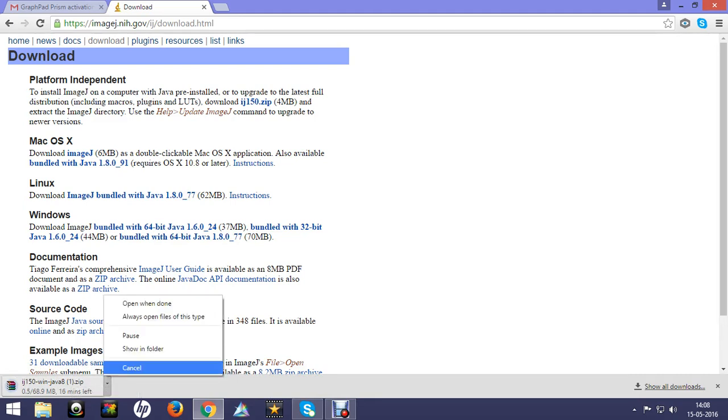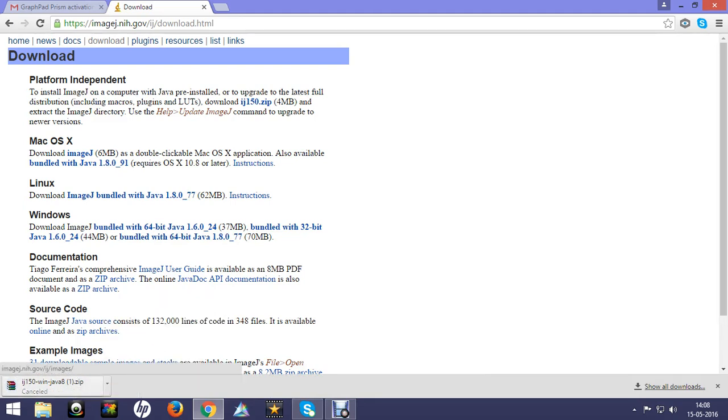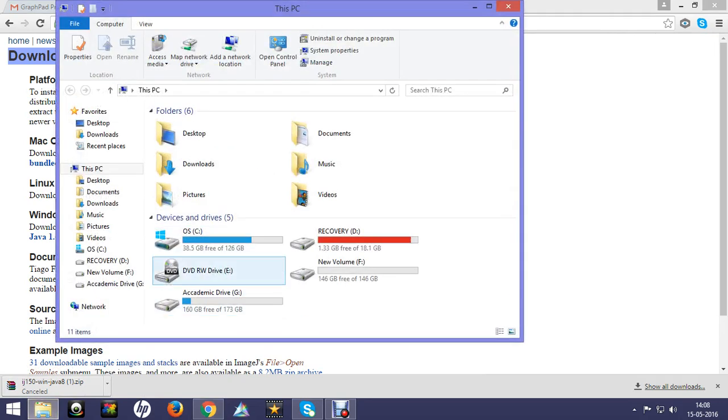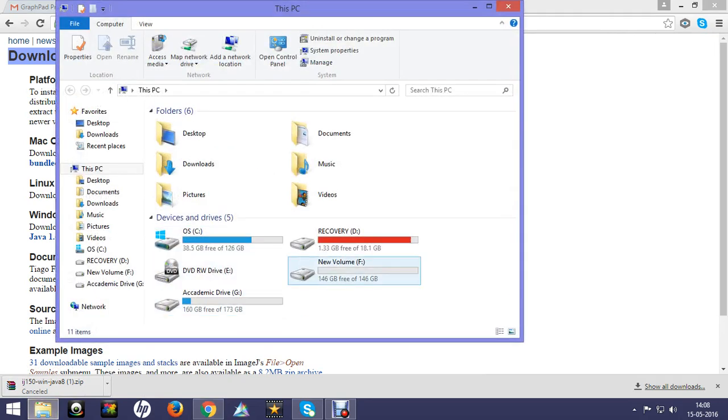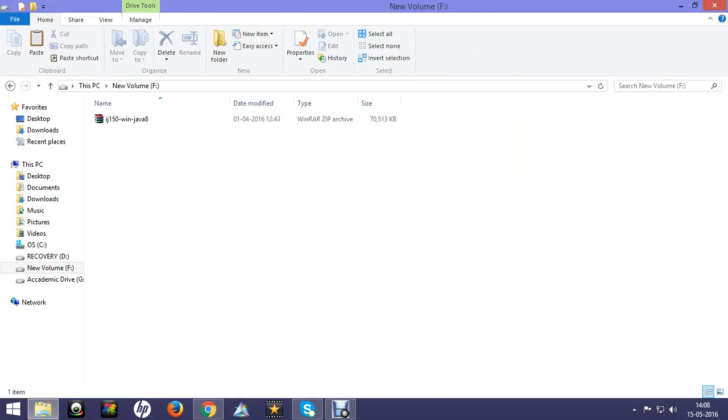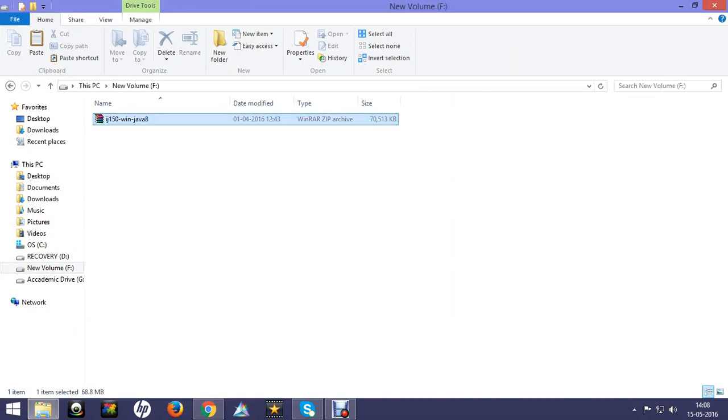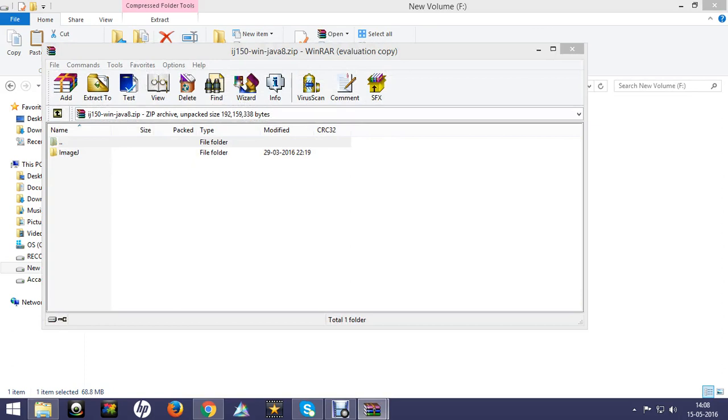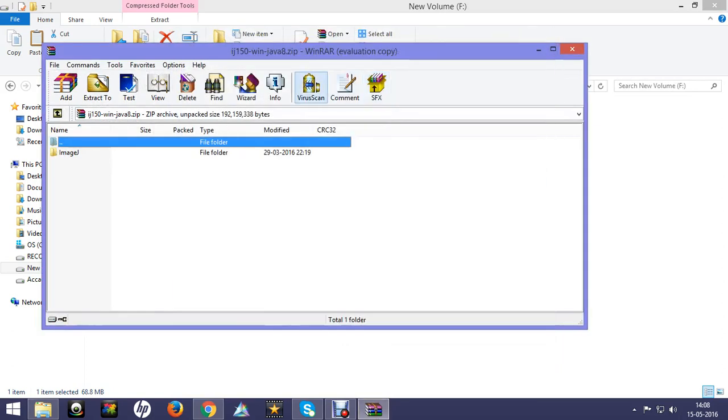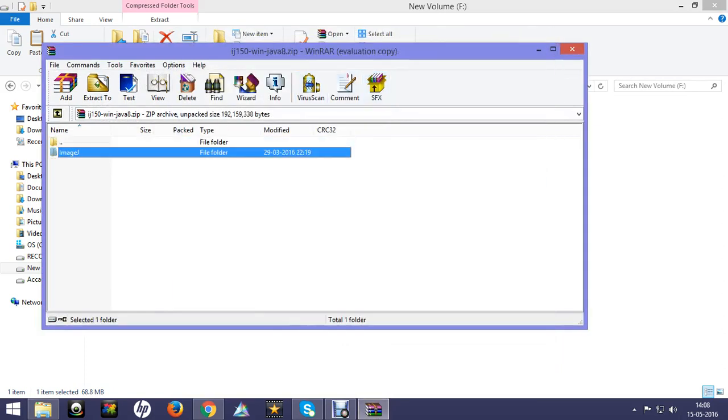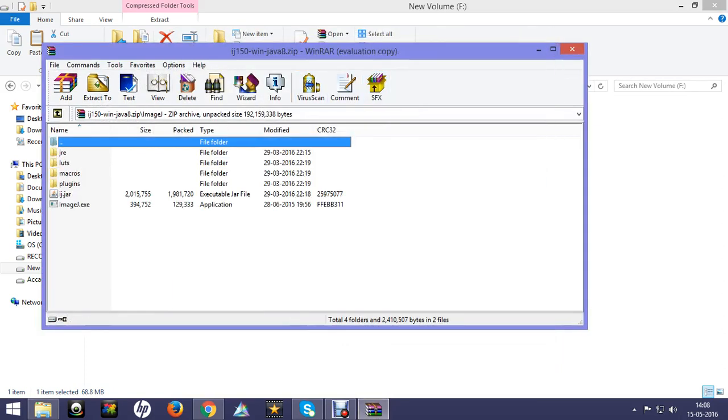As I have downloaded it previously, I will show you directly from there. When we click on that application, there is a folder for ImageJ and there is an ImageJ.exe file, a setup file for ImageJ.